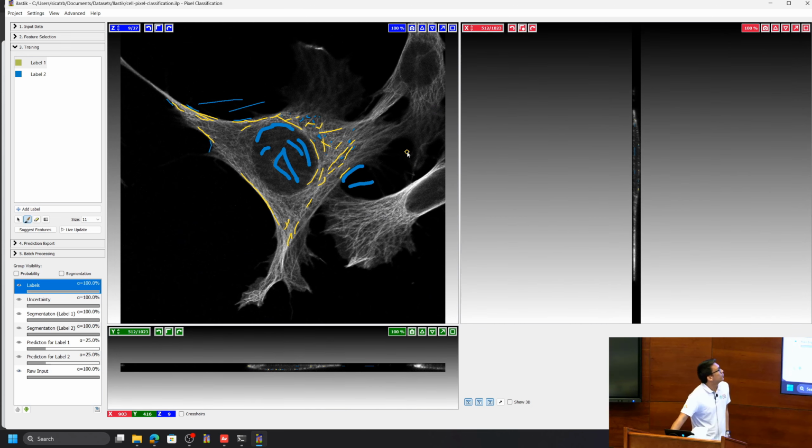So for this data set, I want to extract these tubular structures from the cell. And if you use thresholding in Avizo, it's not gonna work. So here I provide, sorry, I should have shown the steps, but I'll do that in a little bit. But here, just like the AI assisted segmentation in Avizo, you have to do some brush strokes, right? To give it examples.